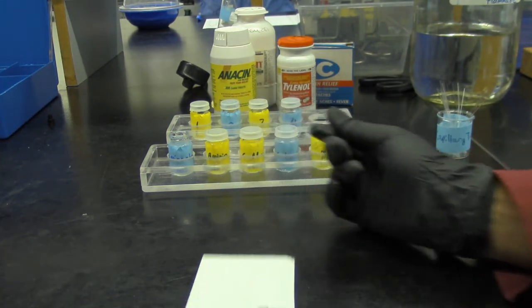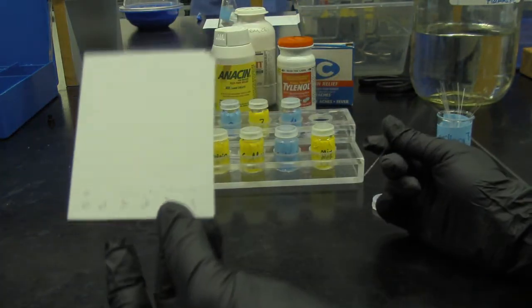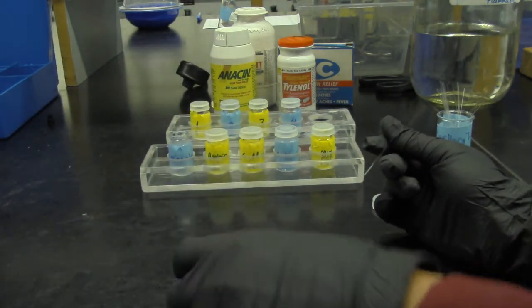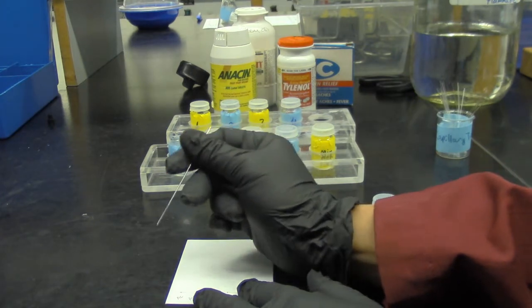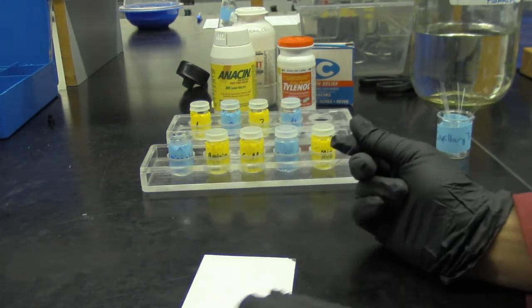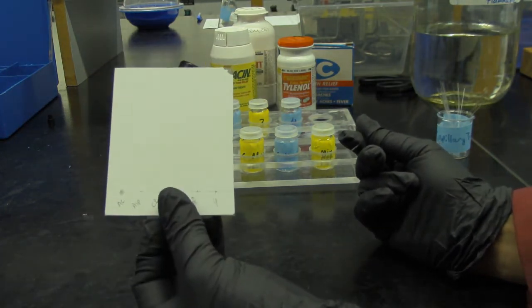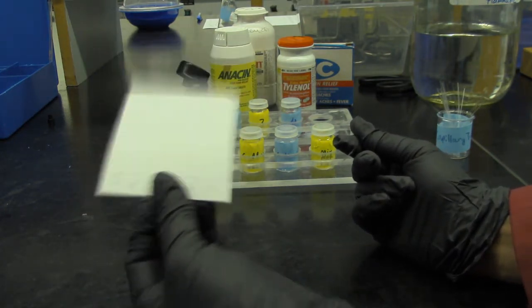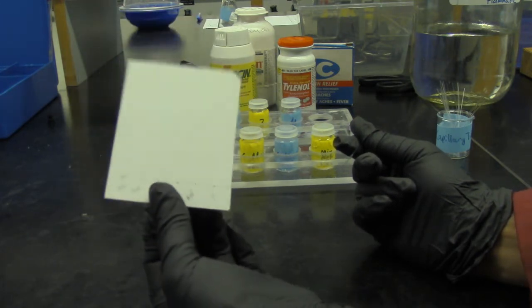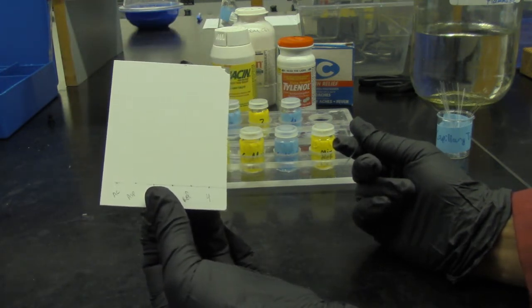And I blow on it. You see the wet spot there at acetaminophen? Once it's dry, I'm going to spot it again. I'm going to shake it dry because it's wet. I do not want the spots to be overly big.